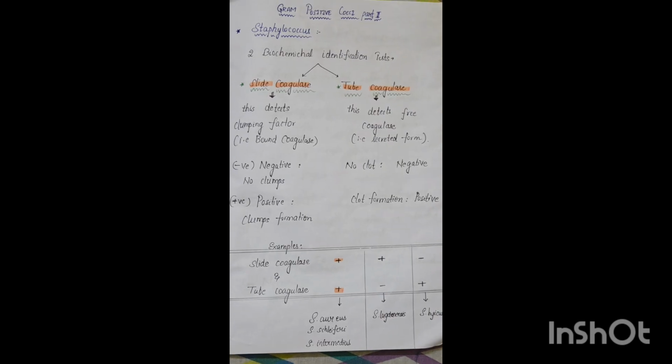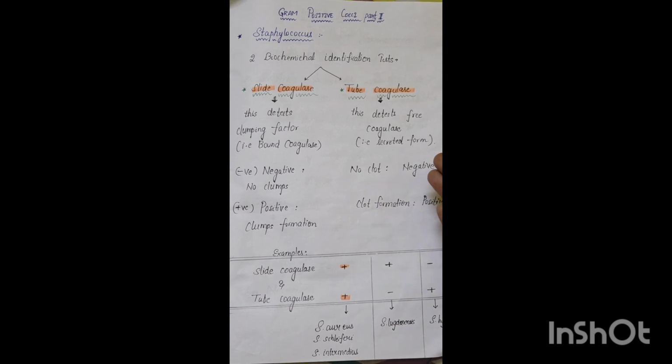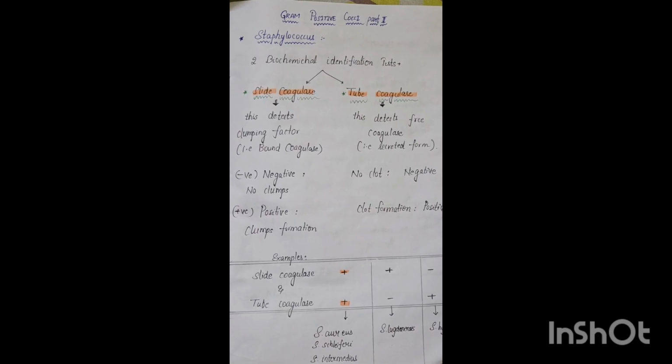So this is a basic introduction video for differentiating the coagulase test into slide coagulase and tube coagulase. Later we can discuss what the coagulase test is and how it is done. Okay, thank you.